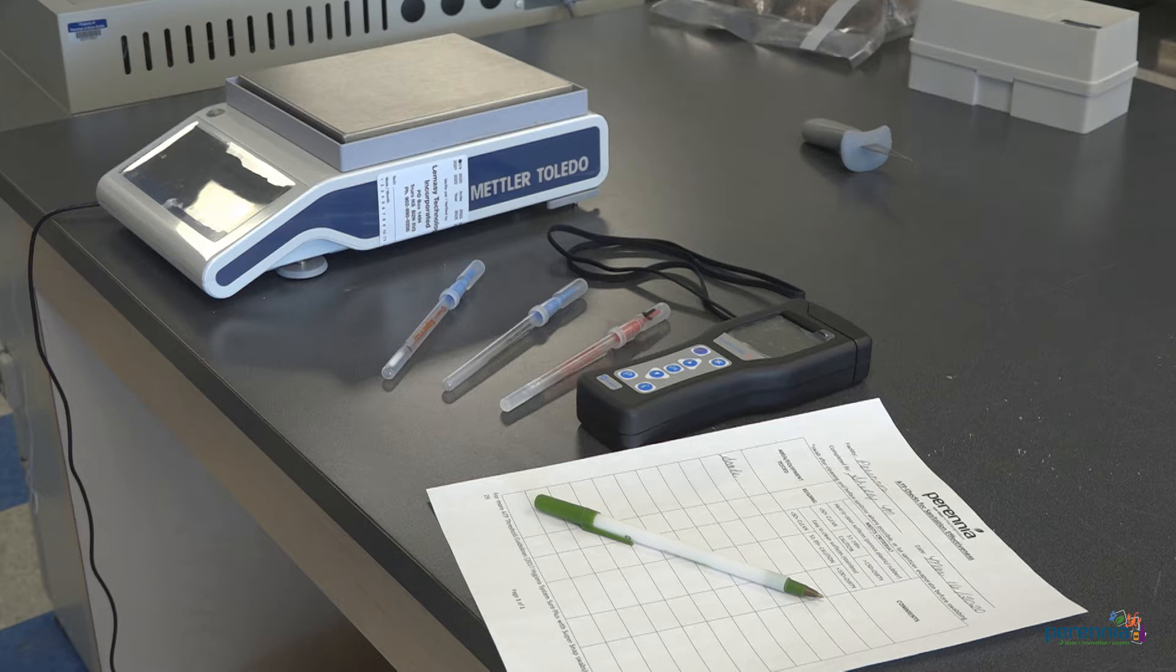ATP swabs should be completed after cleaning just prior to sanitizing. ATP is the energy molecule that is found in all living cells. The higher the RLU reading, the more ATP, meaning the dirtier the surface.